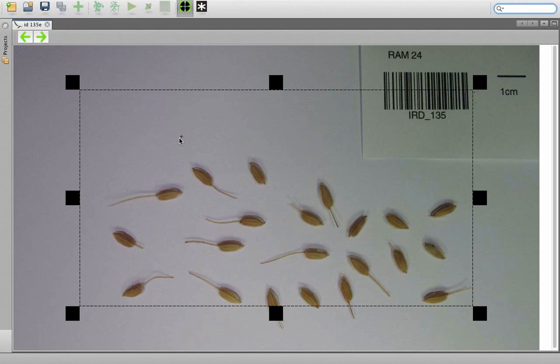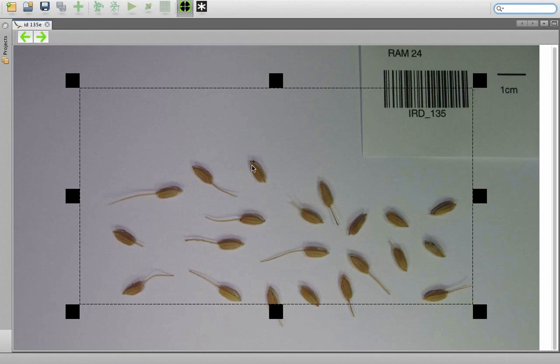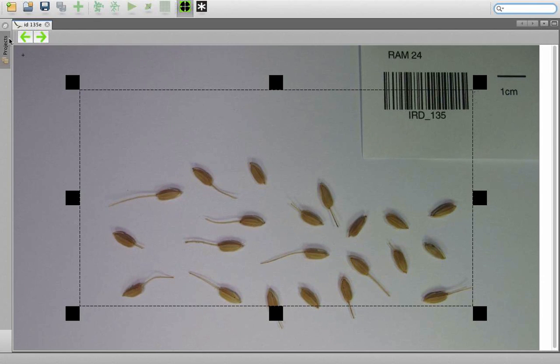In some cases, when we work with different images, there are possible cases where the background is darker than the greens. So we will call this one inverted mode.